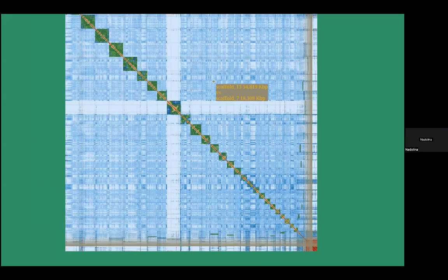So a really good indication of a sex chromosome, especially if it's heterogametic, is going to be this dip in signal here. And that's just indicating that it's lower coverage, simply that there were approximately half the reads that mapped to this scaffold, because there's only one of those chromosomes.